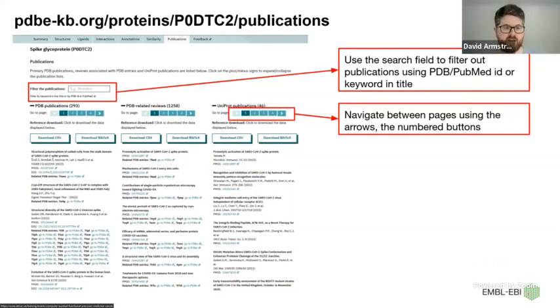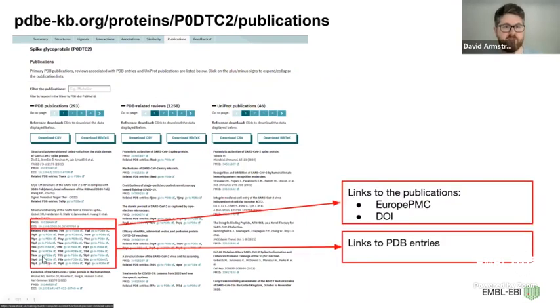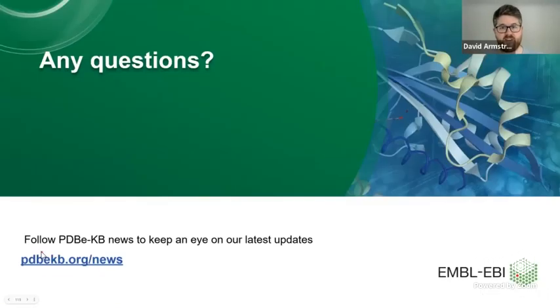Yeah, just one little additional point: one of the data sets that we integrate into our annotations is FoldX, who do this for some examples. If FoldX have done this mutation and then predicted how it might affect the structure, then again, those are linked. Otherwise, everything that Preeti said was spot on.